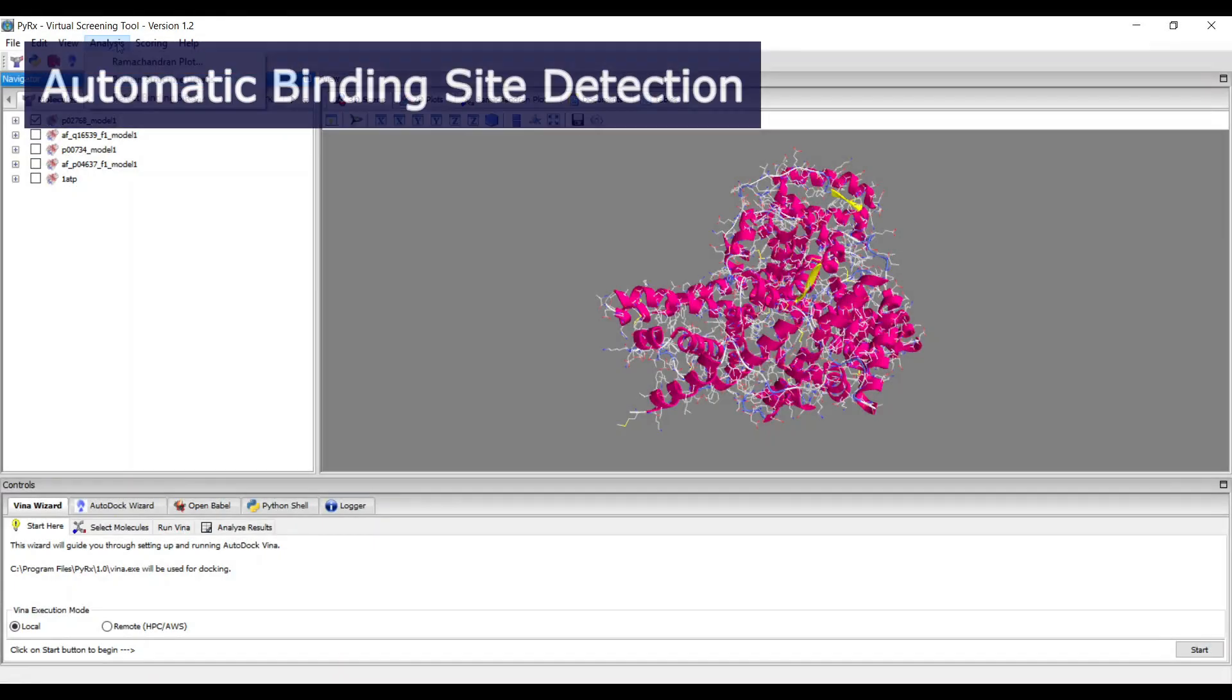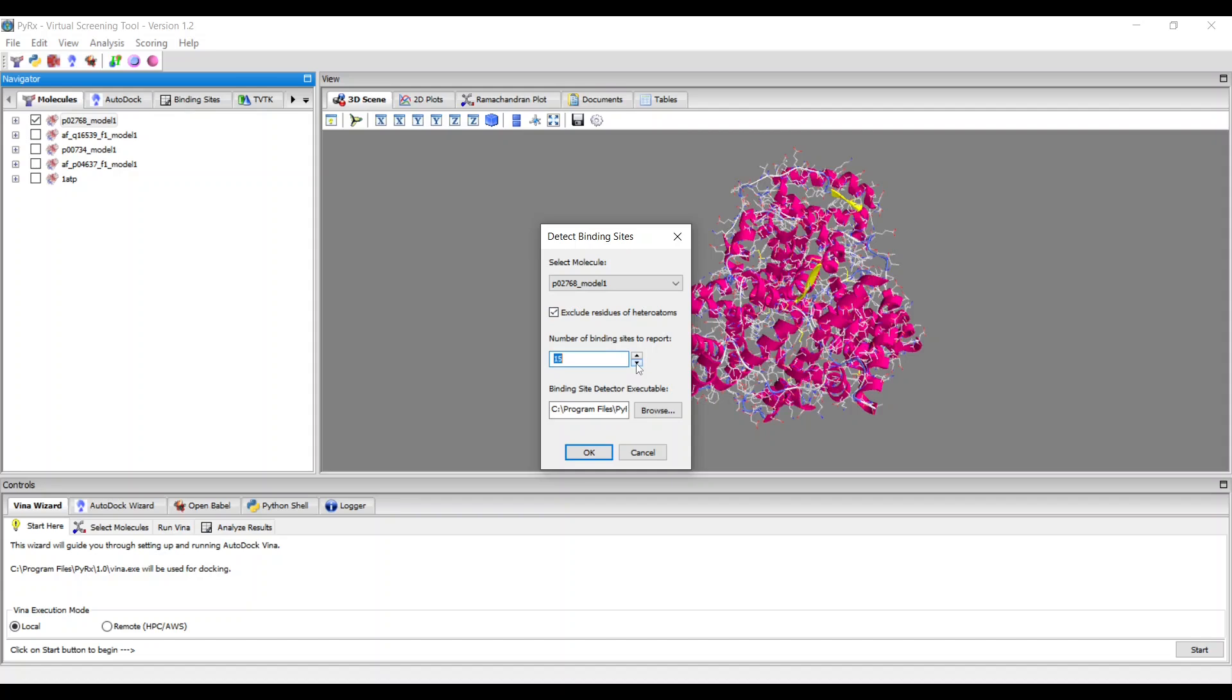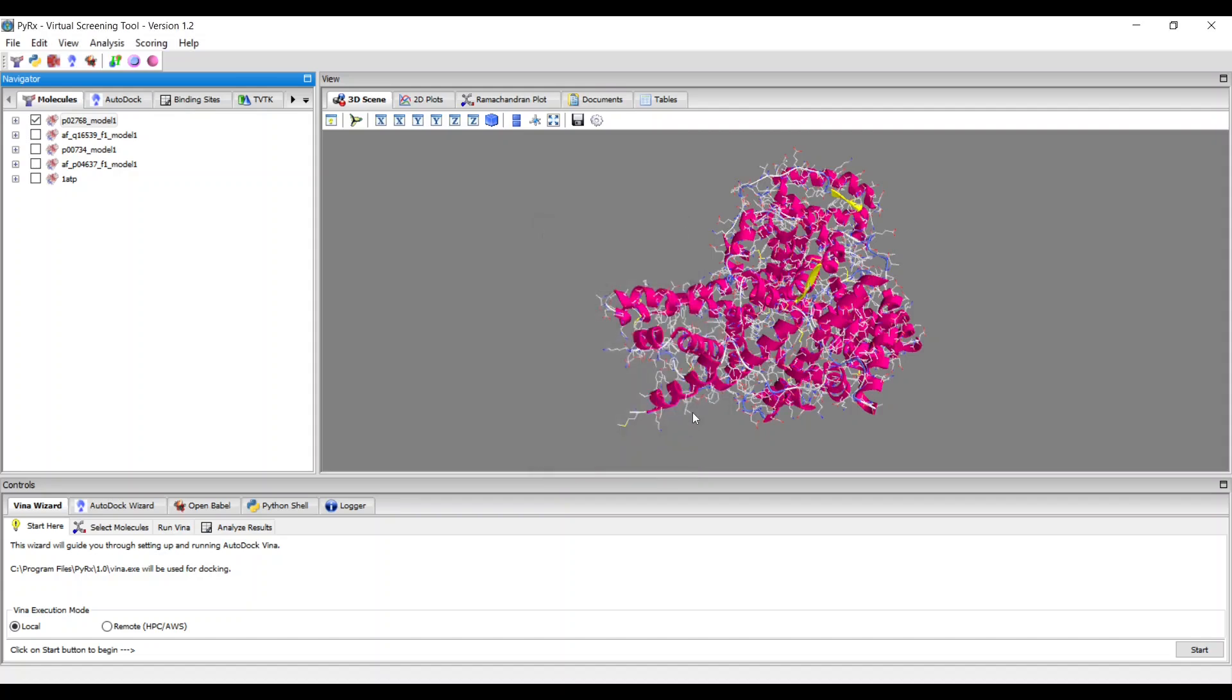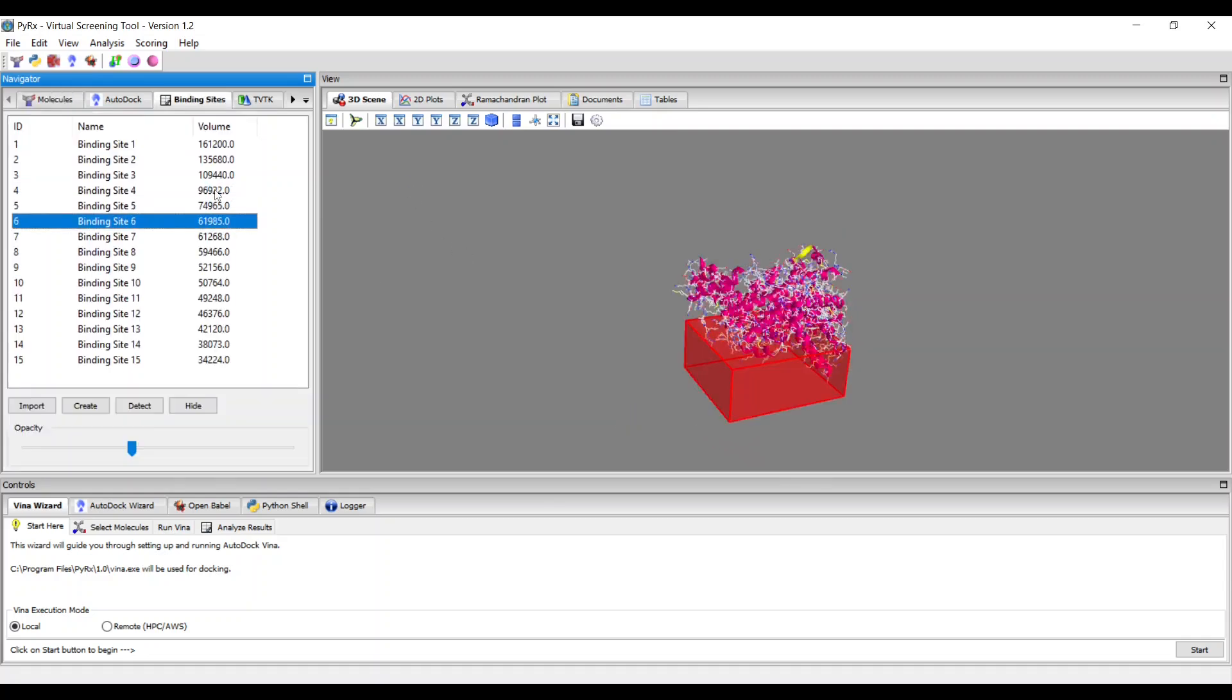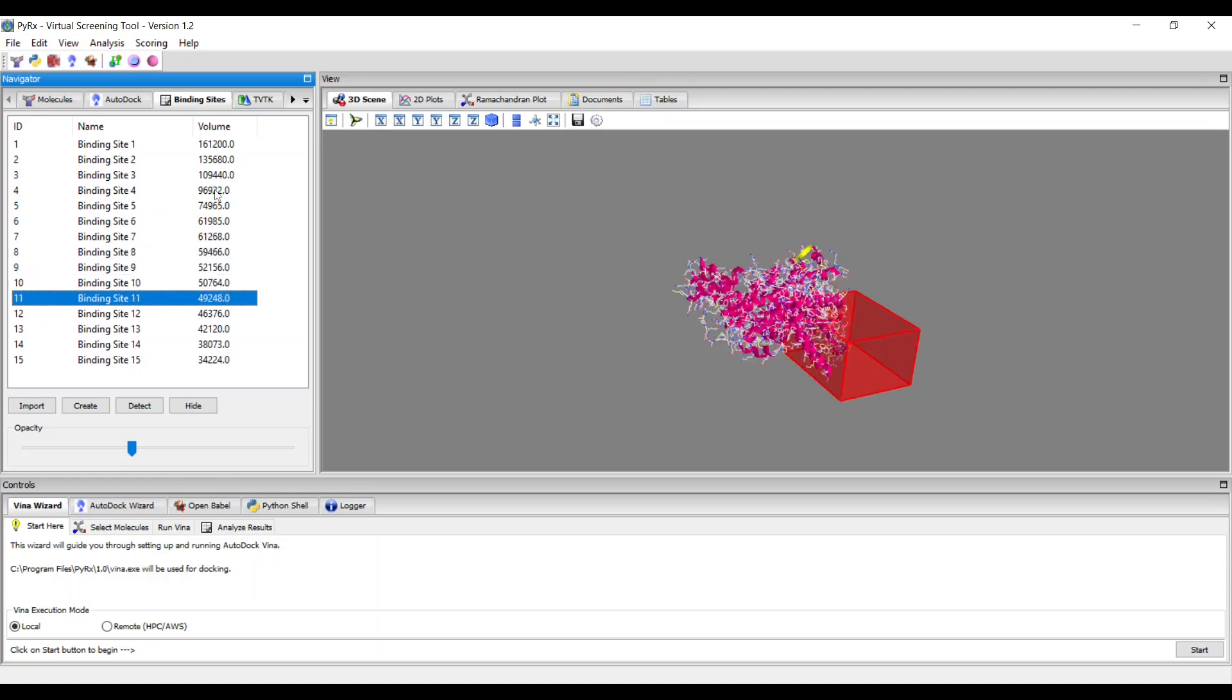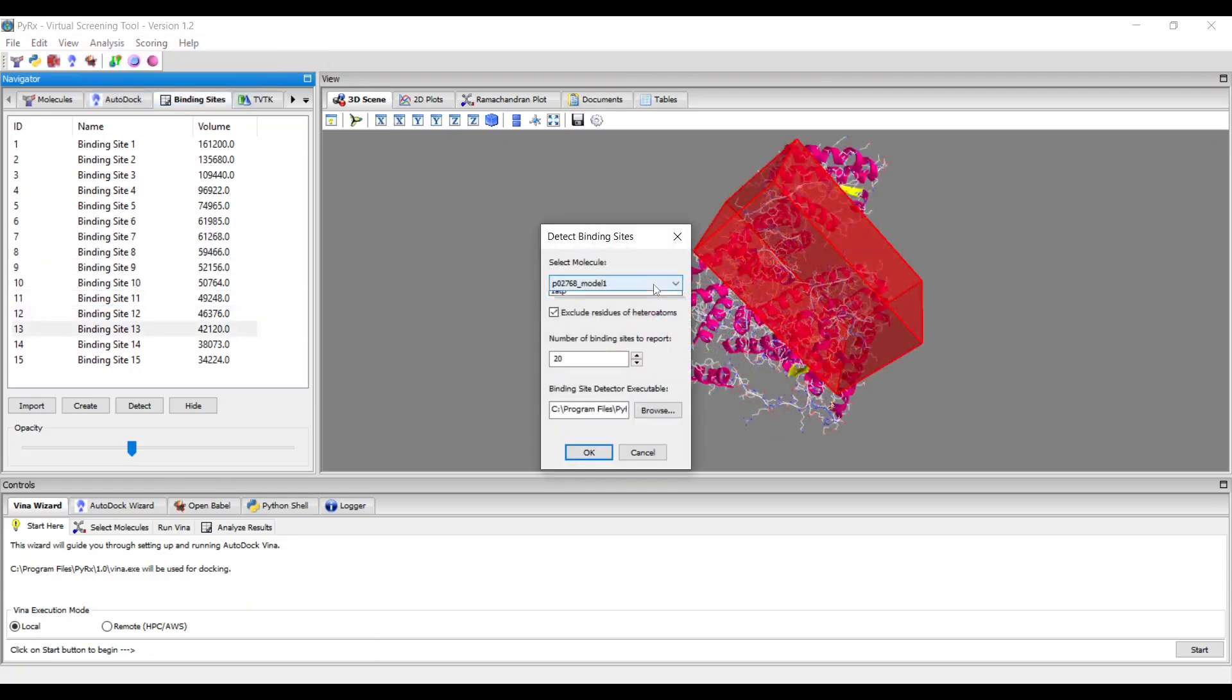You can now perform automatic binding site detection to automatically detect possible binding pockets within a given protein structure. The method utilizes the convex hull algorithm, which is quick and efficient for detecting possible binding pockets.